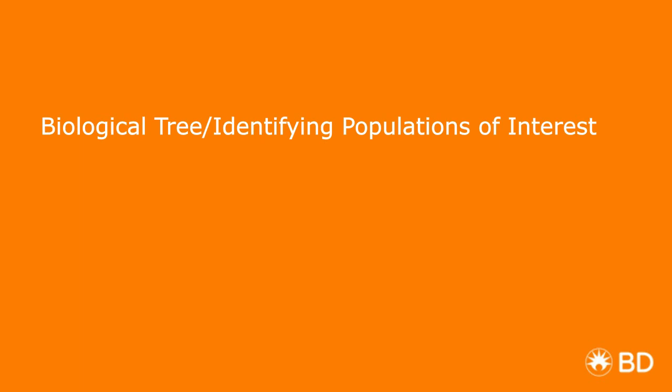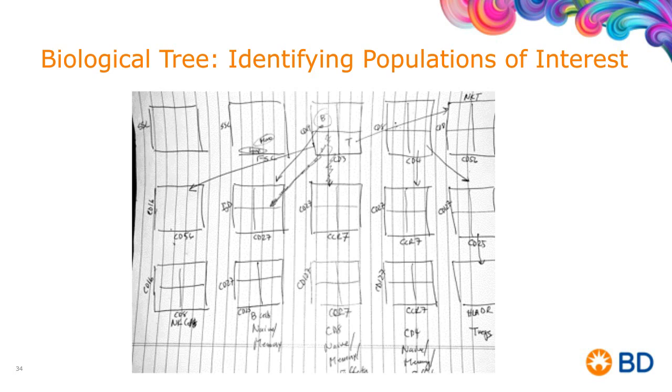But that's all we need, is an idea concept about the flow of the specificities that you need. It helps us identify what's on one side of the tree, what's on the other side of the tree. It tells us a little bit about each specificity, so we can look into the databases and try to determine if they're primaries or secondaries or tertiaries, or how many receptors there are on each one. And when we put all those together, it gives us a place to start.